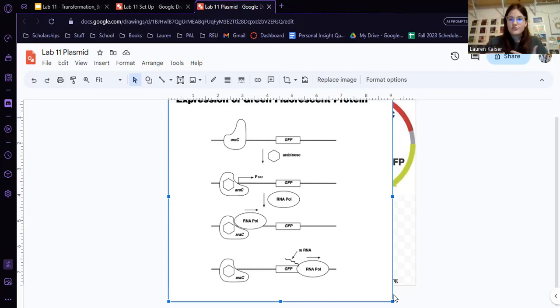Just think back to, if you can go from here and say, okay, now I can think about a question being asked of me. So if Dr. B were to ask you, we put a positively transformed microbe, our E. coli K12, onto LB amp ara.